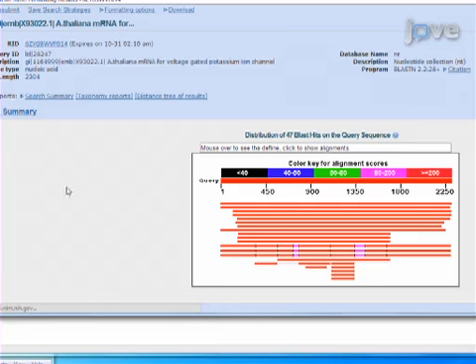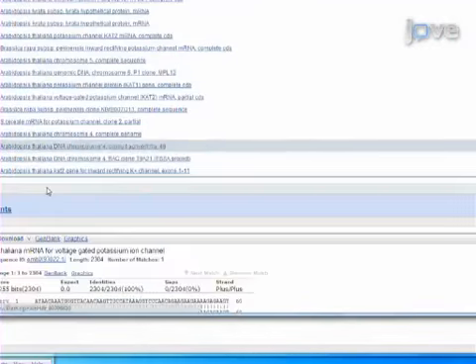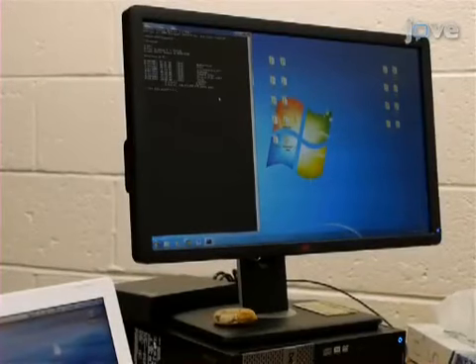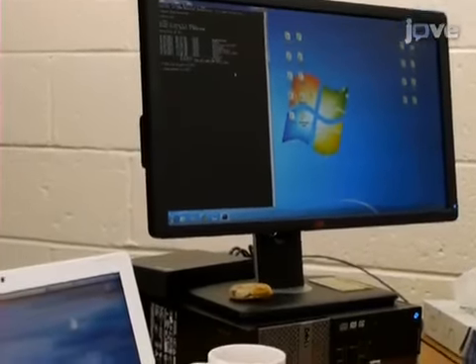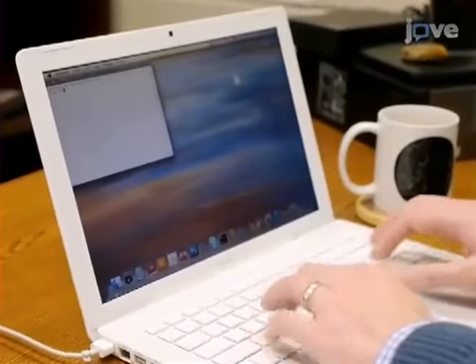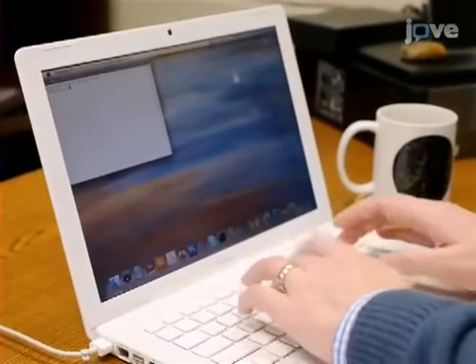The output is in HTML format by default and displays the most similar sequences to the input text sequence. The next section covers using a local BLAST executable on Windows. Mac users can skip to the following section, called BLAST Local Executables for Macs.